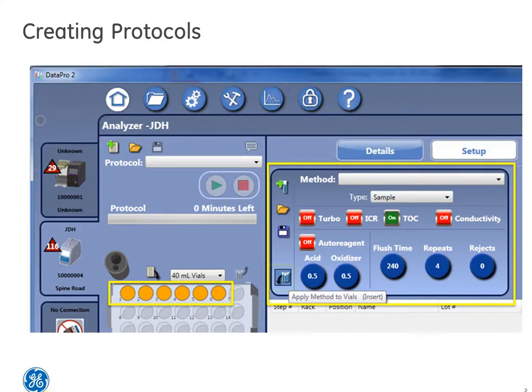Once your methods are set, you have to select the little icon of vials — that's the little icon with the blue vials that you see here highlighted on the screen. This will apply the unique methods to the protocol.